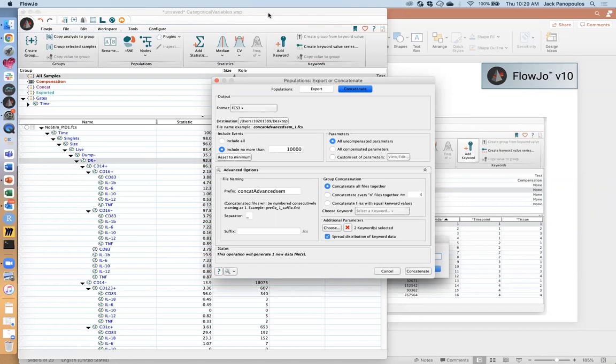All right, so I have a question here. I thought rescaling the axes was purely visual. Is that wrong? Does it change the data point values? It does change the data point values when you feed it into t-SNE or when you feed it into the clustering algorithms. So the t-SNE and the clustering algorithms are not using the raw bin data underneath. They're using what we call the scale space. So what you see visually, when that gets fed into t-SNE, that's the scale that it uses.